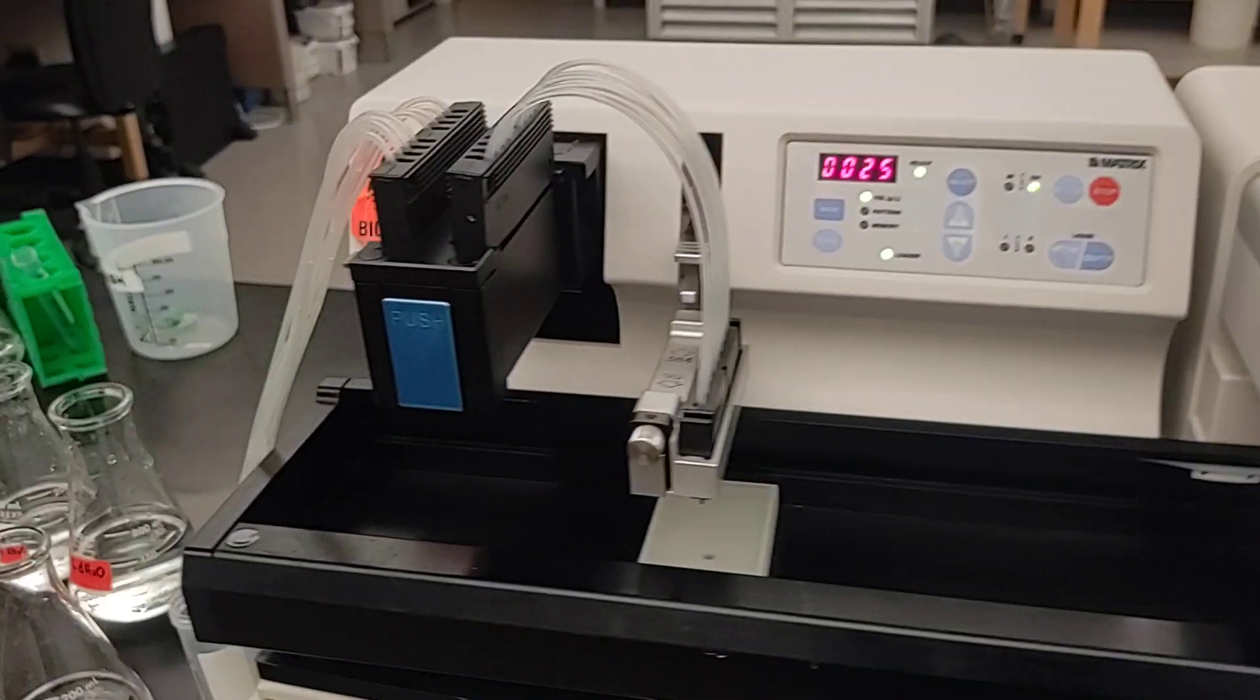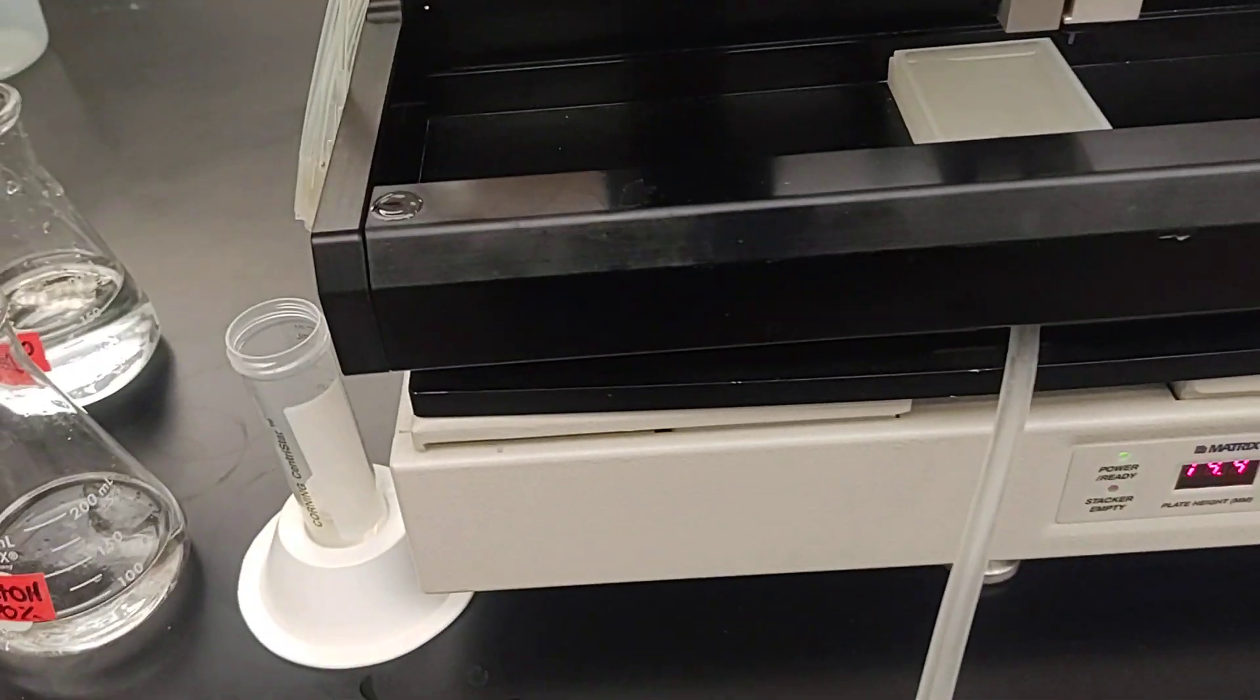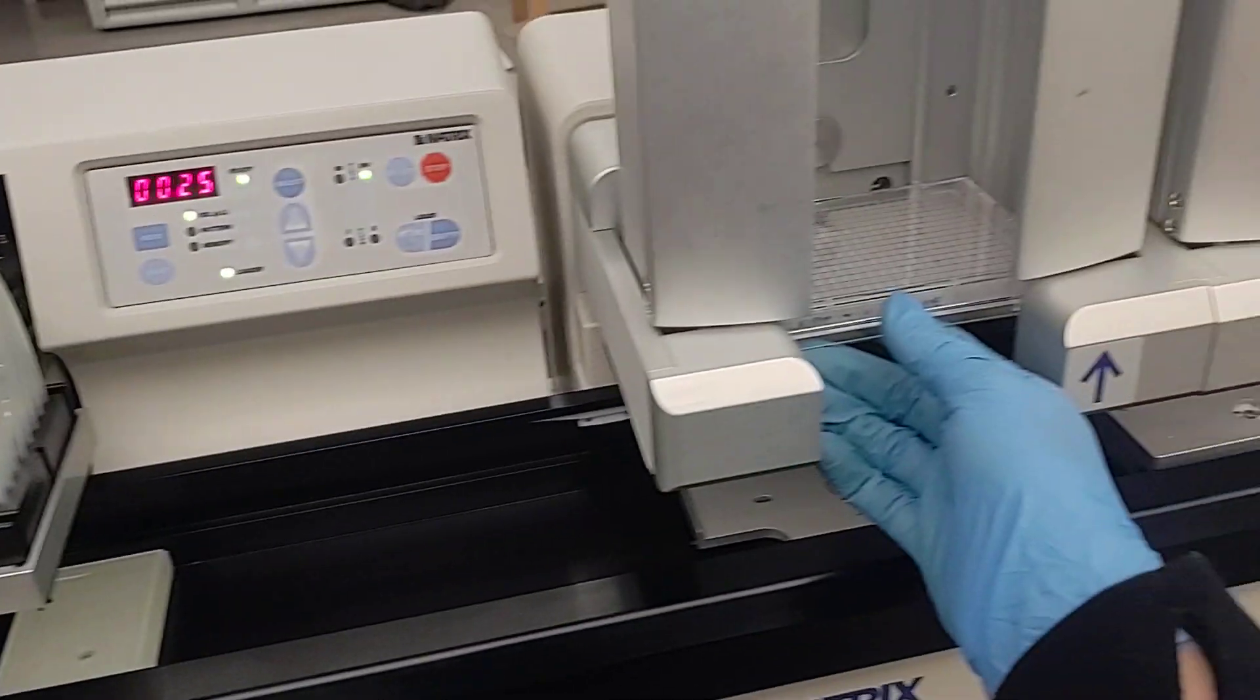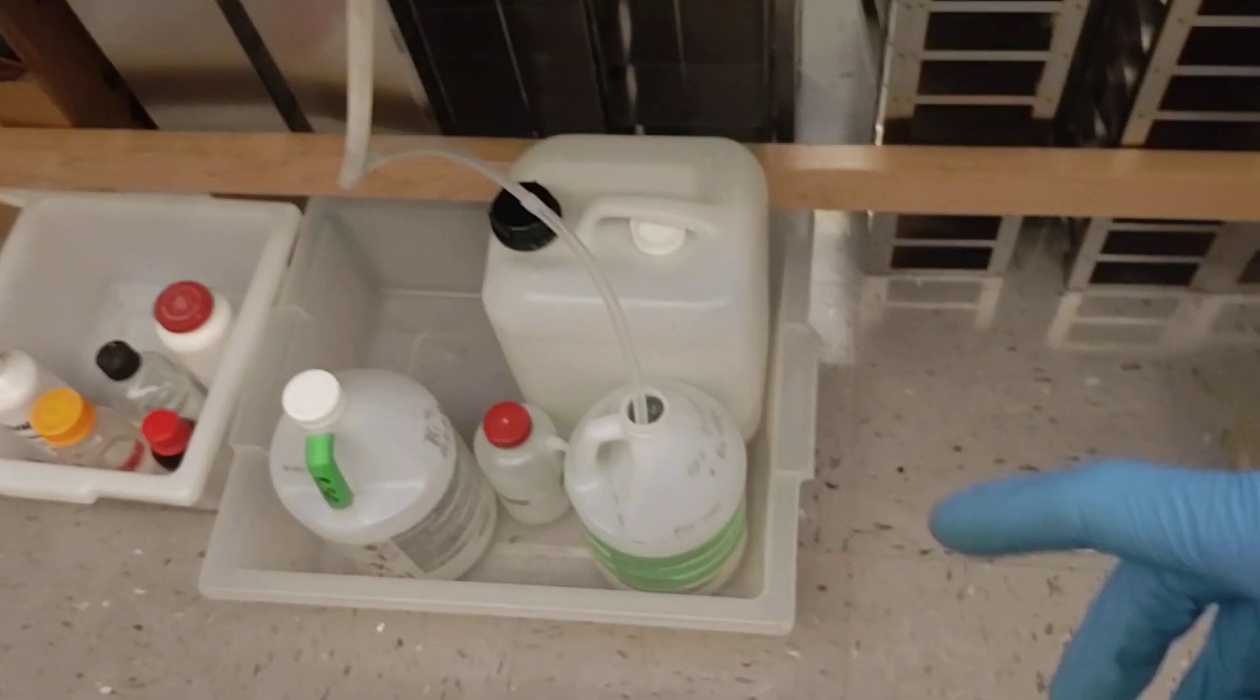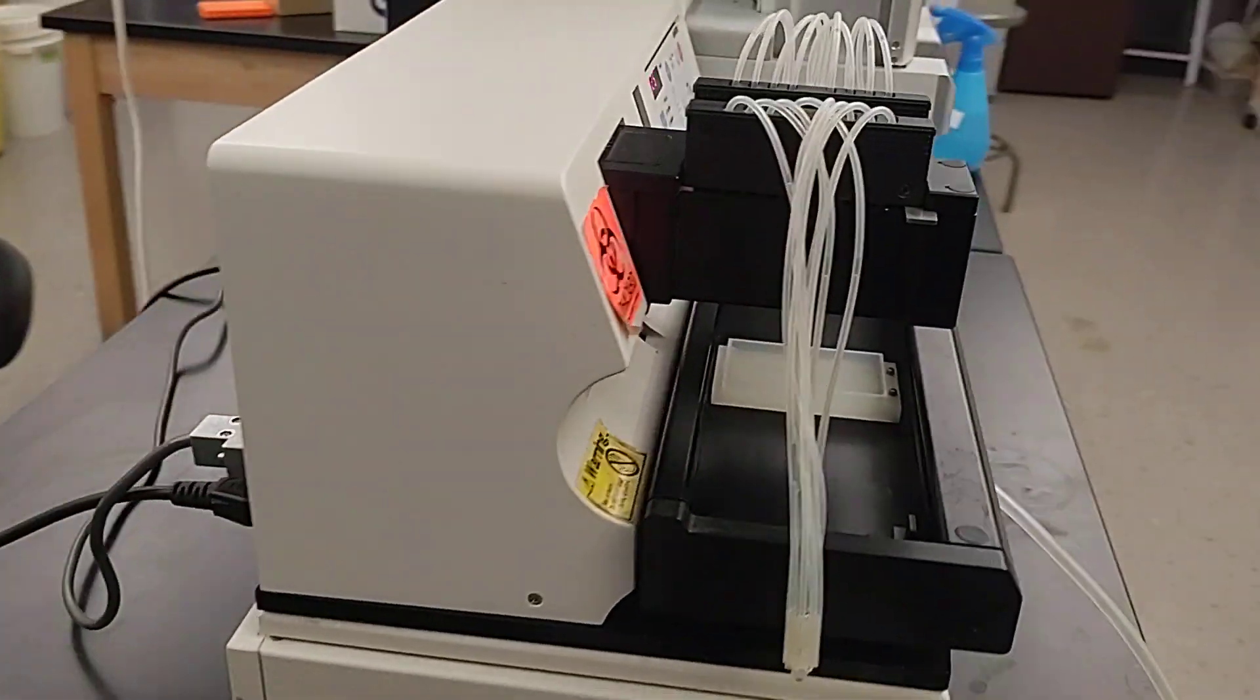When you're done, you want to wash the cassette with this sequence of liquids again. And you will take your plate, you will remove the cassette, put it away in the drawer, close up the waste, and then turn off the stacker and turn off the device.